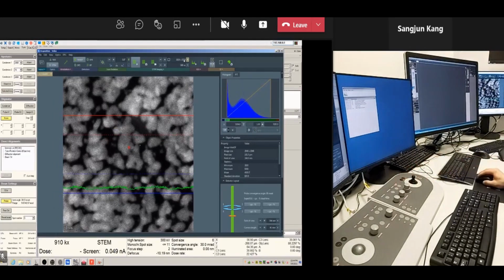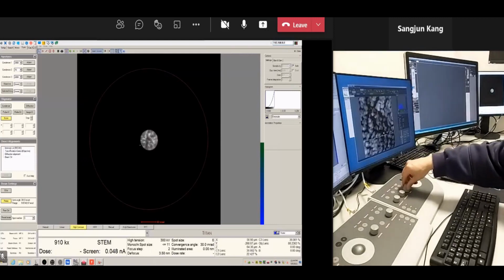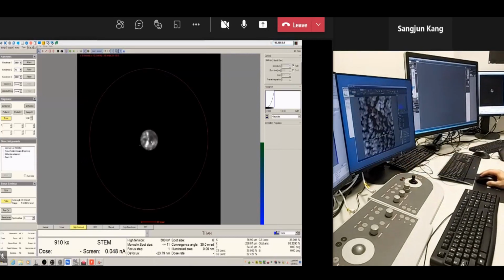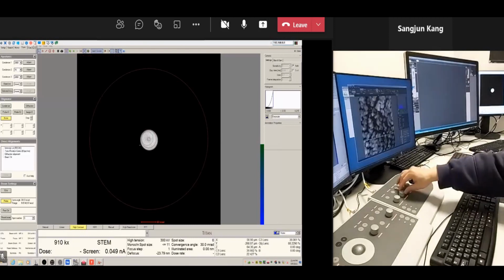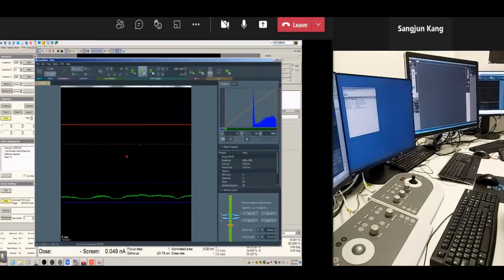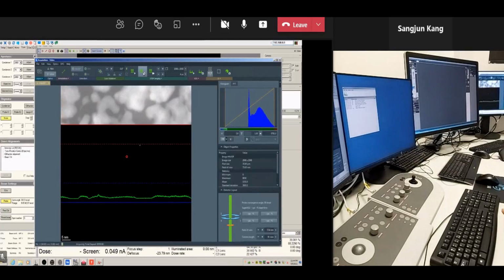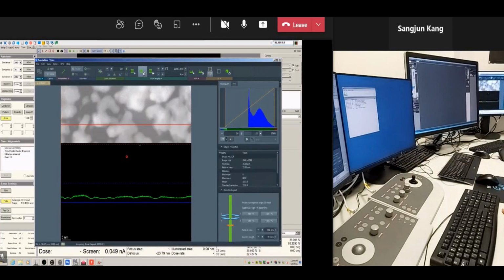Now our probe is a little bit defocused. So in the Ronchigram, we are infinitely magnifying atoms there. So we are basically looking at the Ronchigram, and we can tune our probe quite nicely already. So maybe last image. This is going to be all for today.